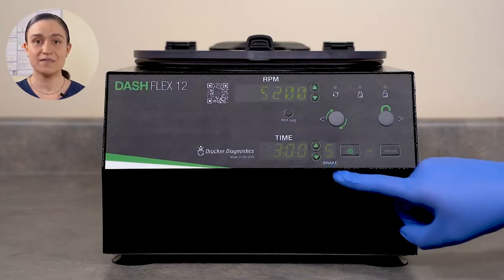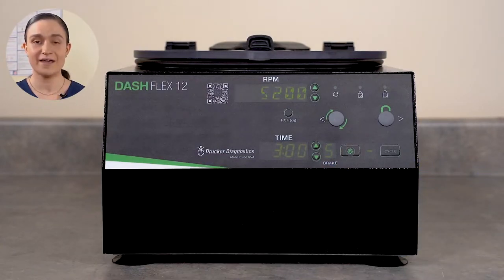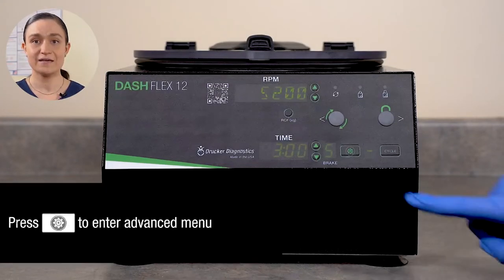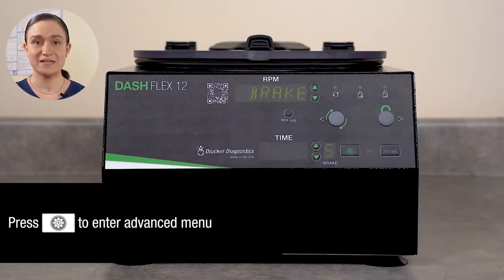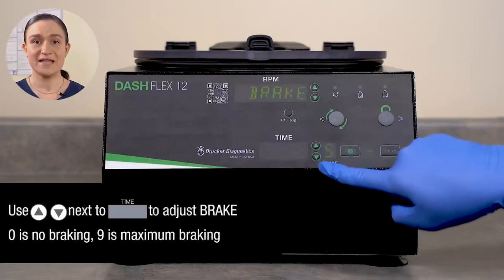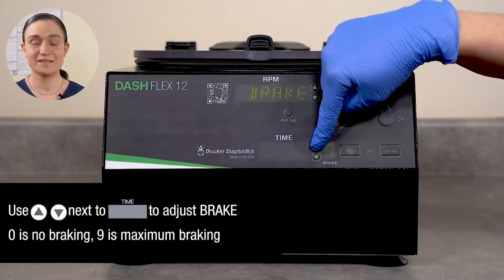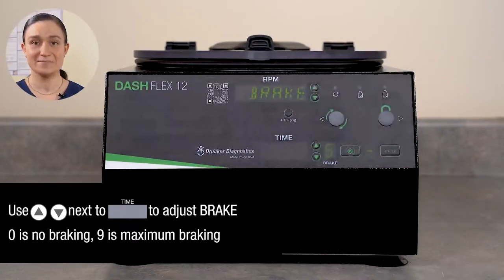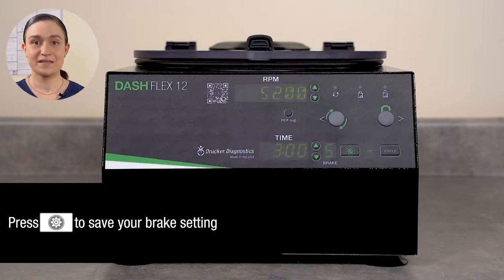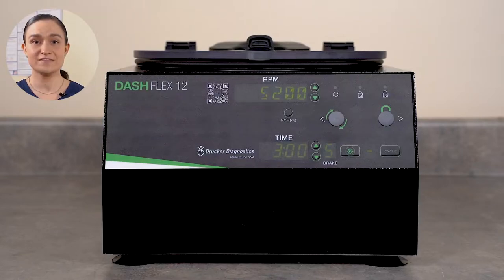The Brake setting controls whether brake will be applied as the centrifuge slows down at the end of each cycle. Brake can be set from 0 to 9 — maximum braking. To adjust braking, press the Menu button to enter the Advanced Menu. Brakes should be displayed in the RPM screen. Use the up and down arrows next to the Time screen to adjust the brake setting: 0 is no braking, while 9 is maximum braking. Once your brake setting is as desired, press Menu again to exit. The centrifuge will run with the selected brake setting until you change it, or until you load a saved setting with a different brake setting.